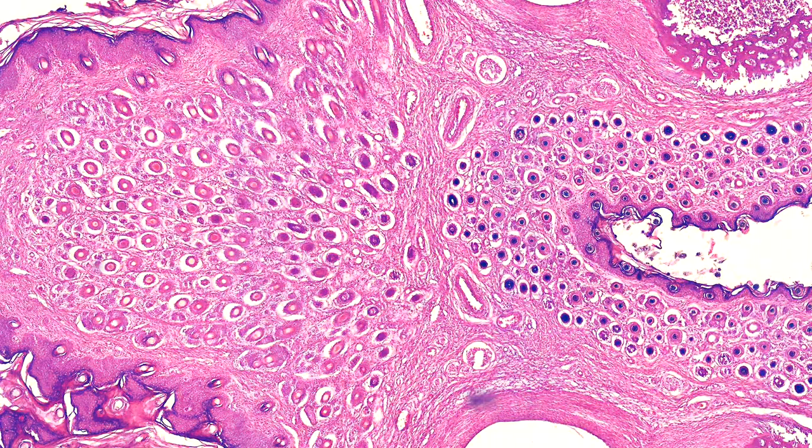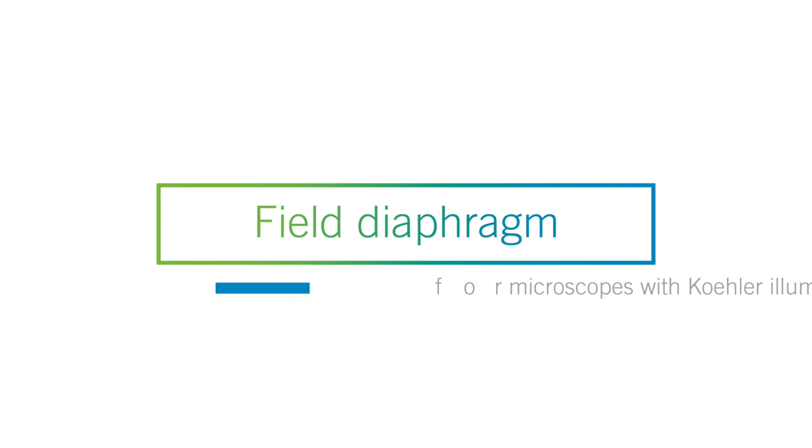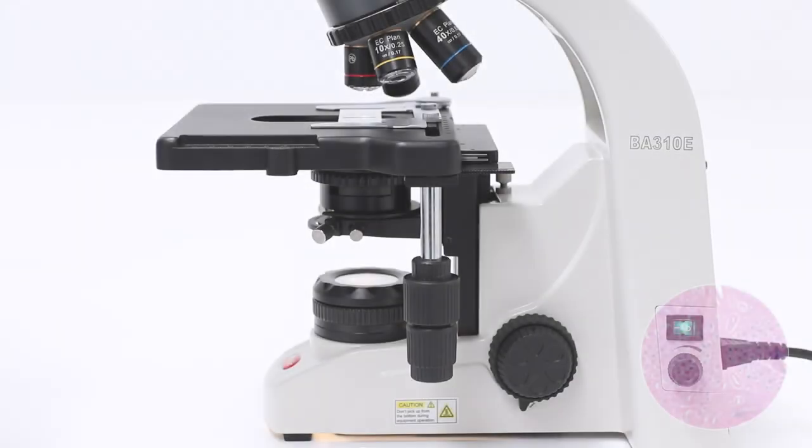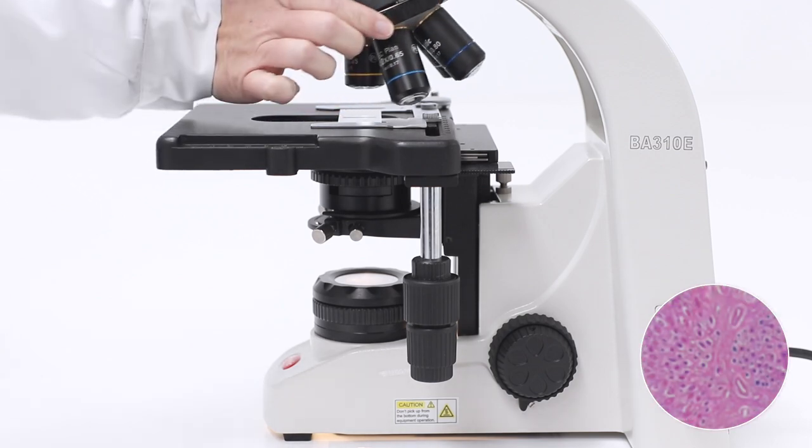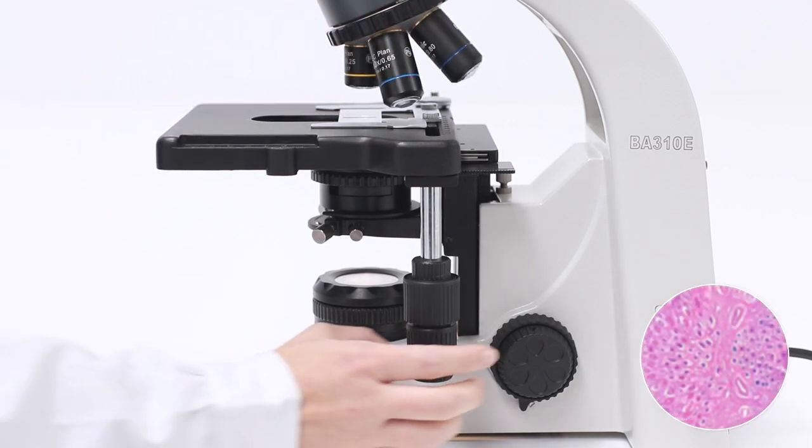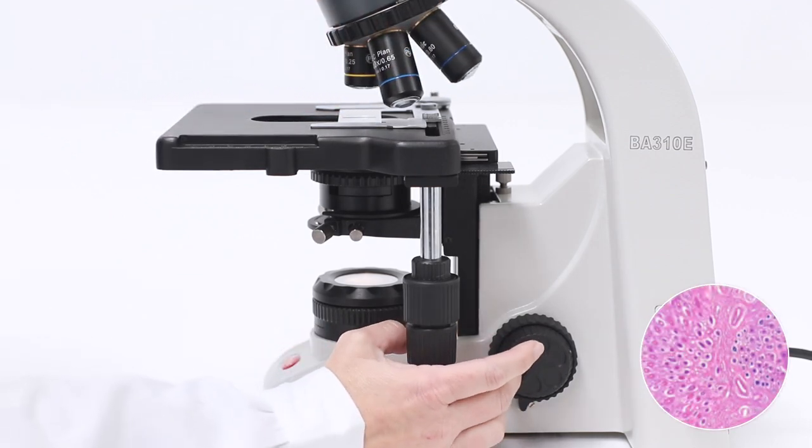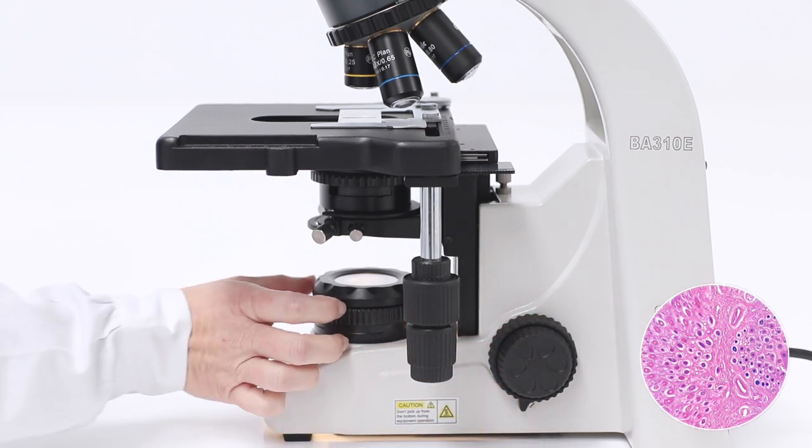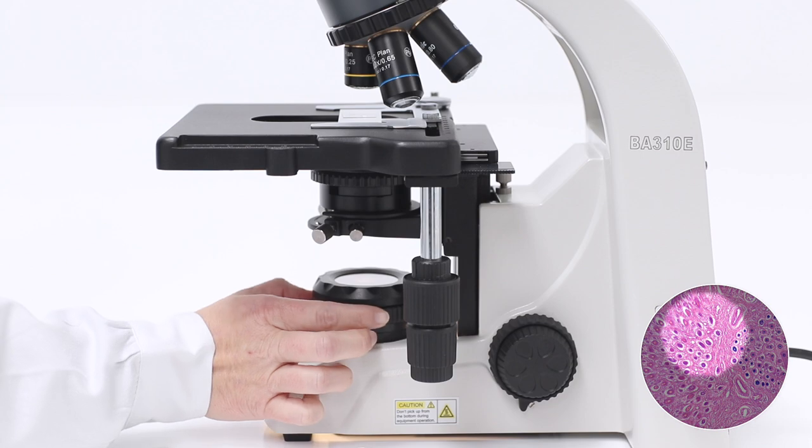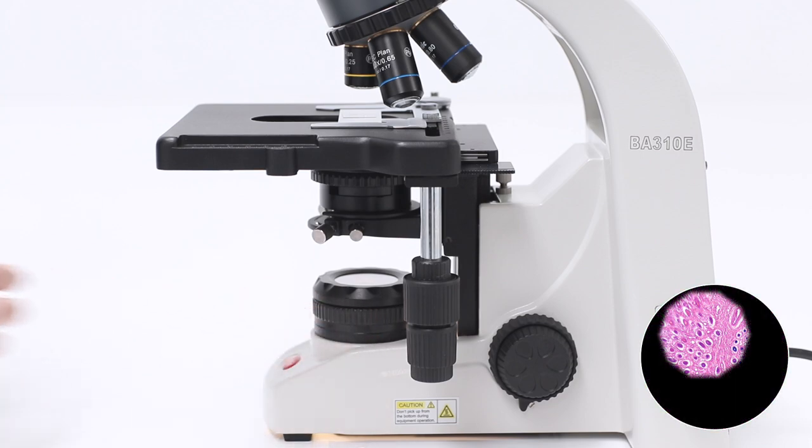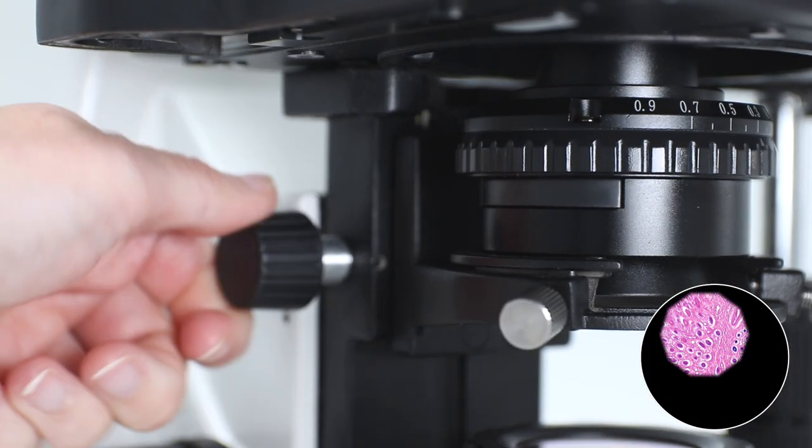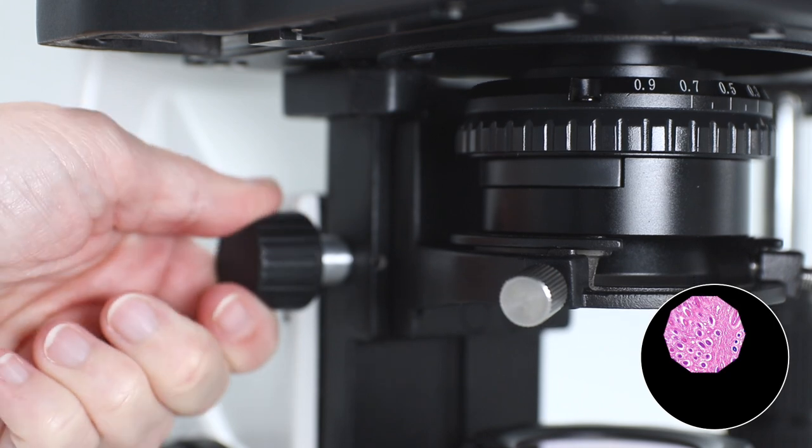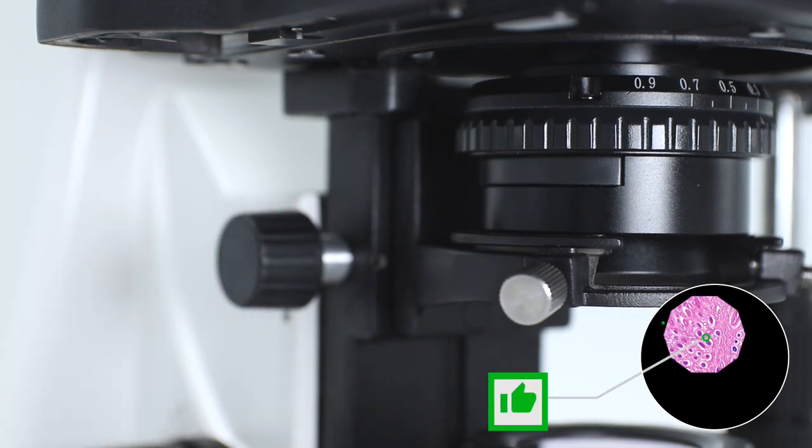For the field diaphragm, place the 10x objective on the light path and focus the sample. Close the field diaphragm until it appears in the field of view. Focus the edges of the diaphragm by using the condenser's focusing system. Both the sample and the diaphragm must be focused.